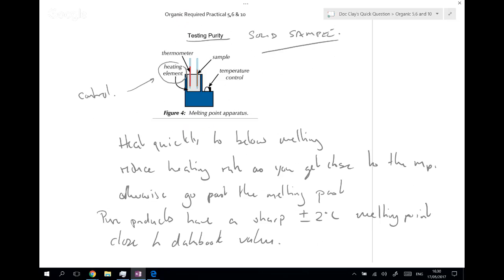And as you start to heat up, all of these things start to rearrange and will affect the overall melting point, either making it higher, but more often making it lower than normal, because it's adding a certain amount of irregularity into the structure, often meaning the intermolecular forces are further apart. If they're further apart, they're longer, and therefore they're weaker intermolecular forces, and therefore a lower melting point.